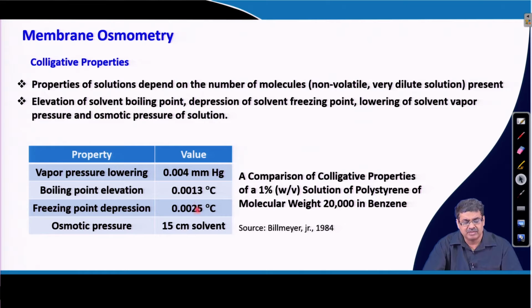These are very small amounts, so they are very difficult to capture experimentally, and there is always some error involved in these techniques. So for this course I will mainly talk about osmotic pressure, and briefly mention the other 3 techniques after speaking about the osmotic pressure method.